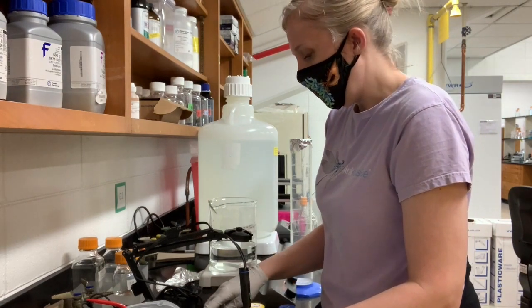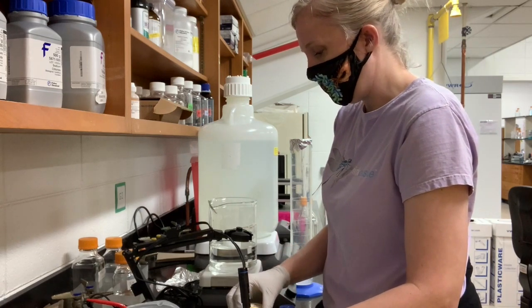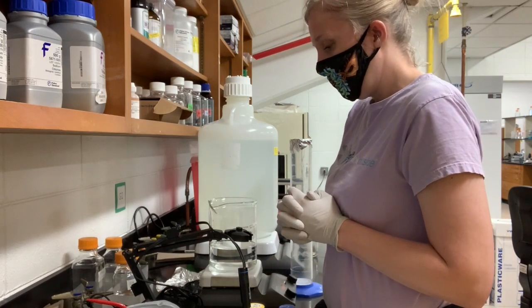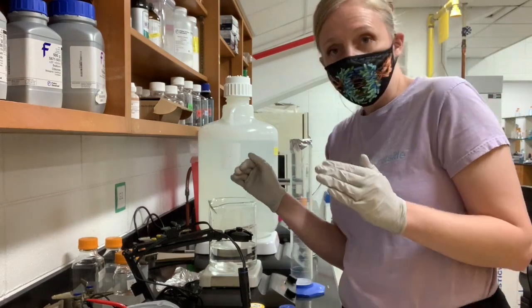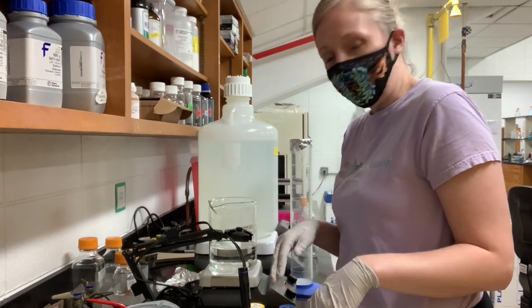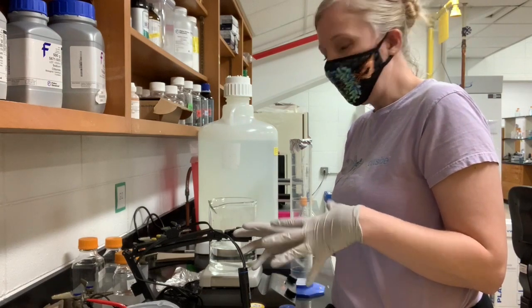And I'm going to hit next, which will be F2 on the pH meter. And then I will hit start, which is F3. And then I'll have the same thing. There will be another line, P2, and the pH is blinking at 10.04. And this should be pH 10, so that's pretty close. And this meter's pretty smart.